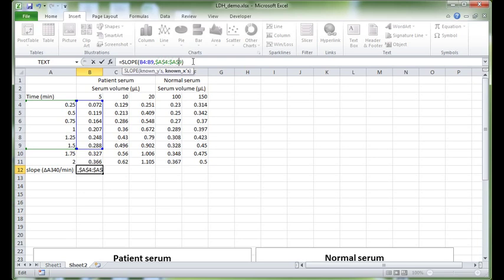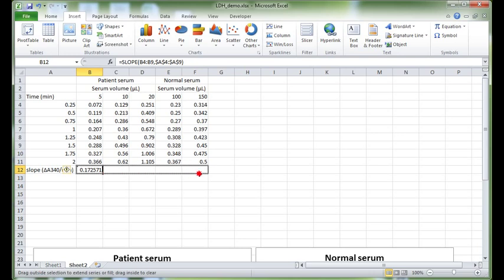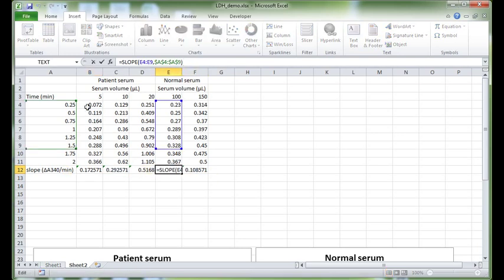Okay, so it goes from A4:A9 to $A$4:$A$9. And if we hit enter now, what we can do is click and drag, and if we go back into E12 we can see that Excel has fixed in place the green box, and it's actually updated the blue box as we've dragged. And so this thing is called absolute referencing. It's quite useful to know.